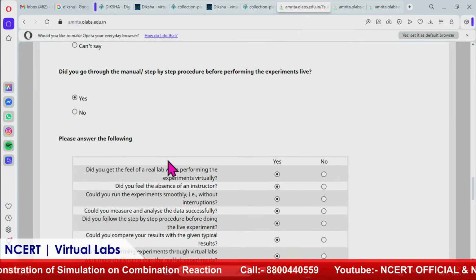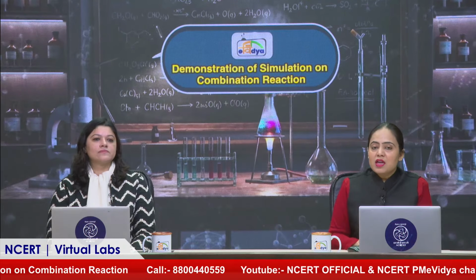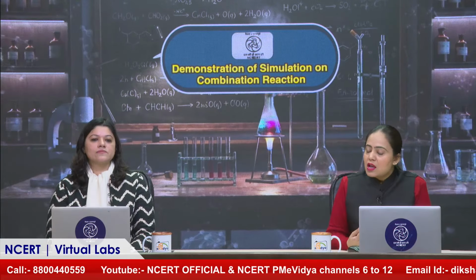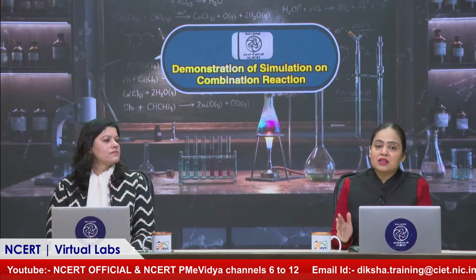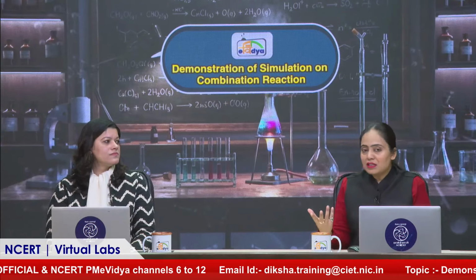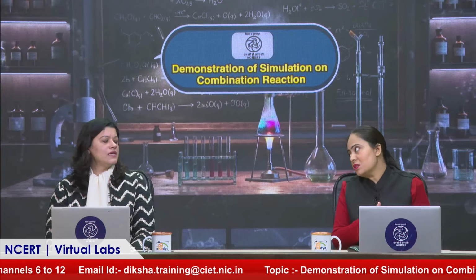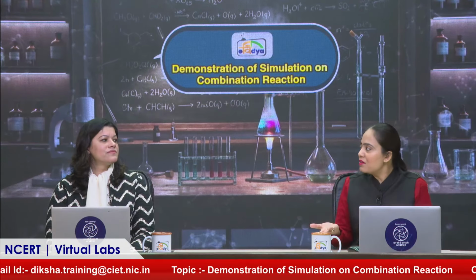Right. So this is amazing that you not only perform the simulation, but you also evaluate yourself, and you can give us feedback on what changes you want to see on the website or in the tool itself. But there is one question I want to ask you. What if I want to learn more? I know that I'm performing an experiment of class 10. I can jump to class 11 and 12 if I think I'm able to solve those things. And if I'm not able to understand a concept of class 10, I can always go back to previous classes' content. But what if I want some more reference material? Do I get some hint from here as well? Yes.